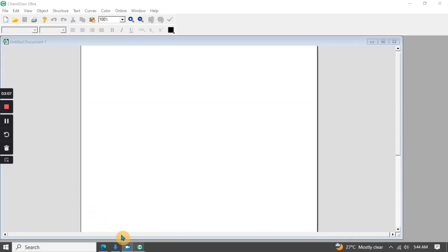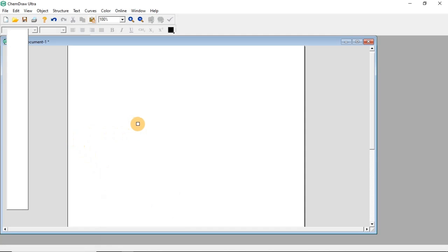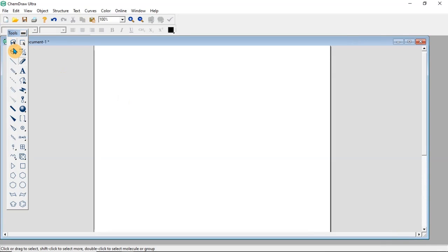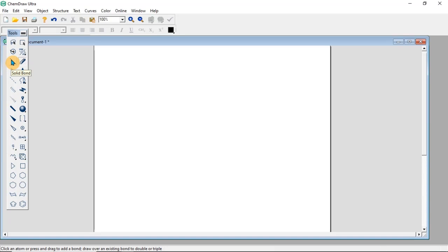This is the ChemDraw software after opening, and these are the key features of the software. Let's go through the various features and how you can use it to draw chemical structures. These features here are what you are going to basically use to draw structures. Here is the working area, the interface where you are going to draw. We have the main tools, and the first is the select tool.